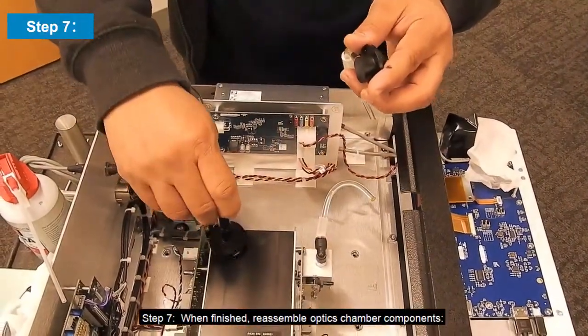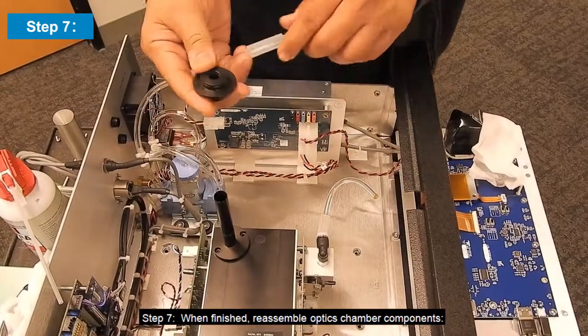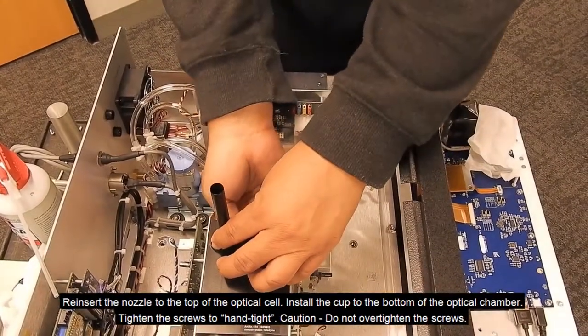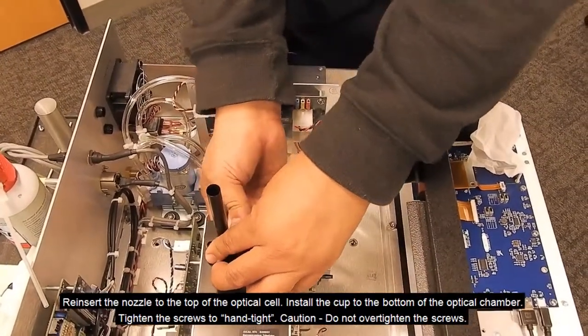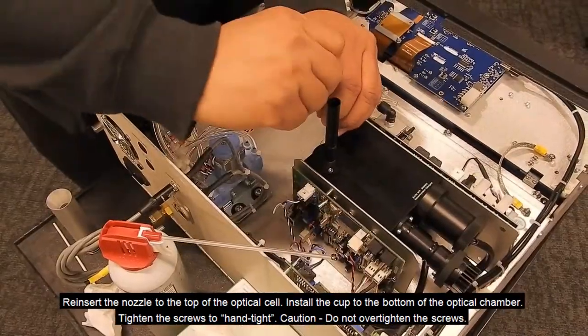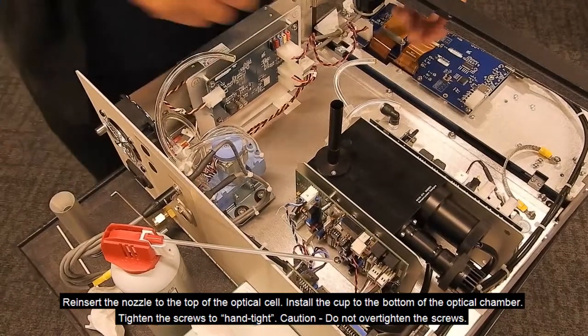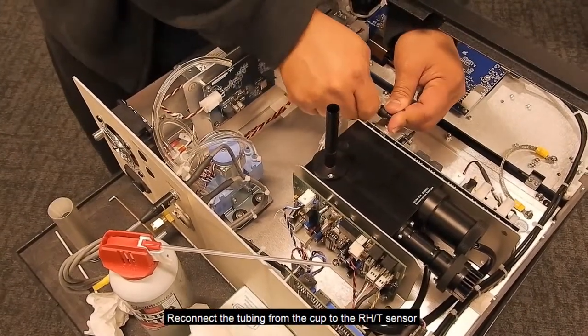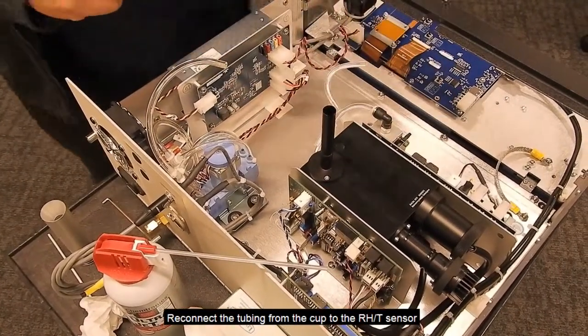Step 7: Once finished, reassemble the optics chamber components. Reinsert the nozzle to the top of the optical cell and install the cup in the bottom of the optical chamber. Tighten the screws to hand tight. Caution: do not over tighten the screws. Reconnect the tubing from the cup to the RHT sensor.